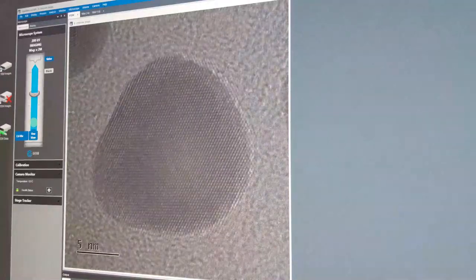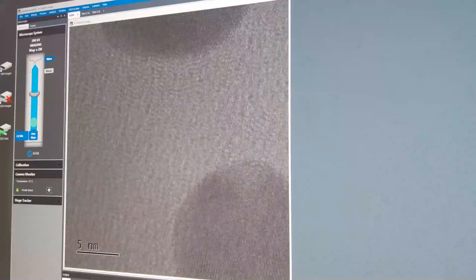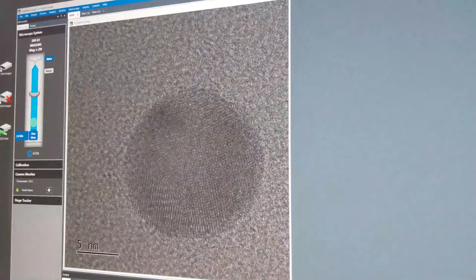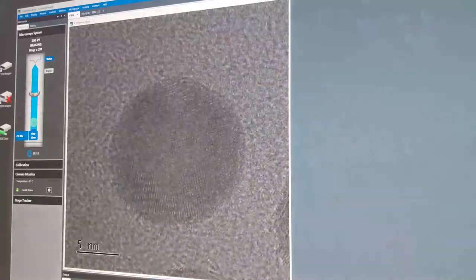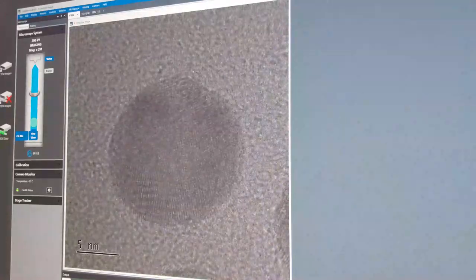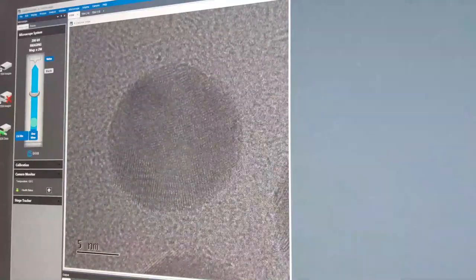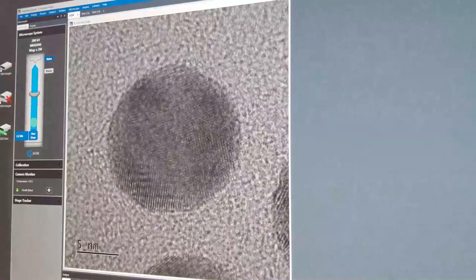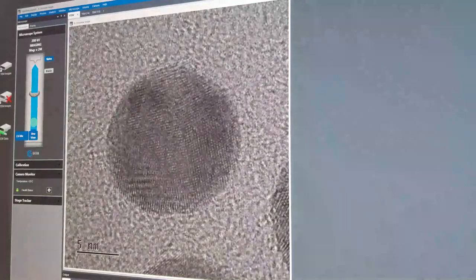Let's move around and have a look at some other nanoparticles. We can see different nanoparticles are in different orientations — that's what we discussed when we talked about diffraction — and that means we don't see quite so clearly the atoms in this particle.